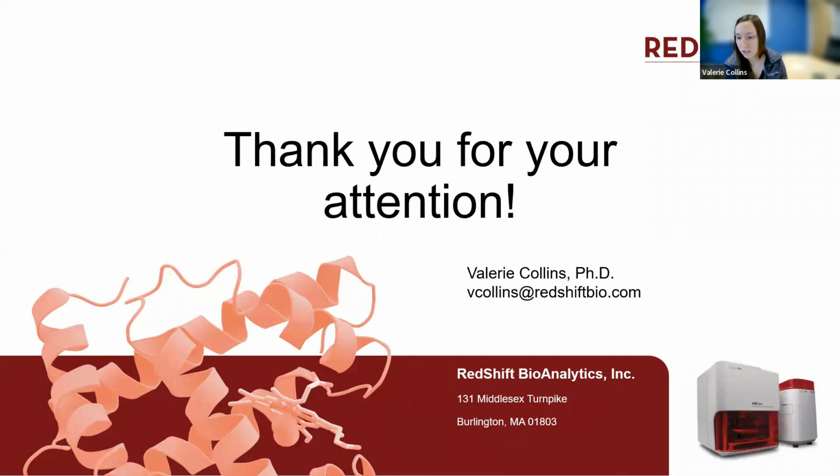The minimum concentration required, so we had mentioned previously, 0.1 mg per mL is our absolute lowest. 0.5 is usually what we recommend for good higher order structure calculations.